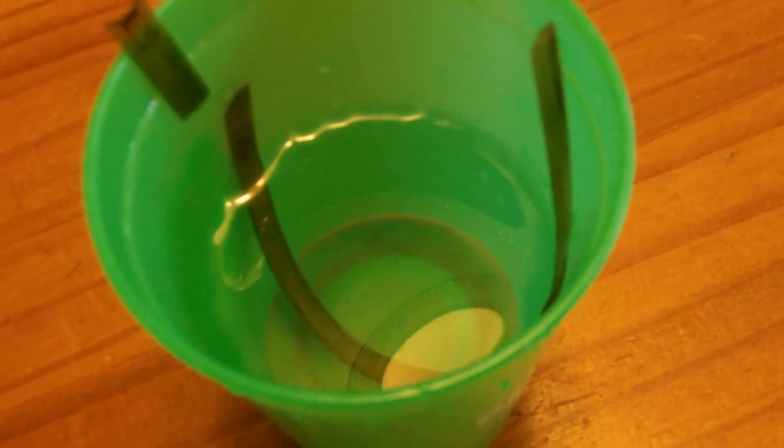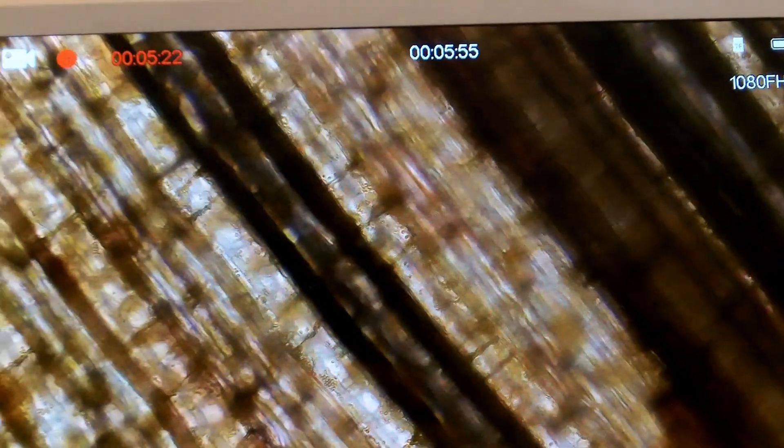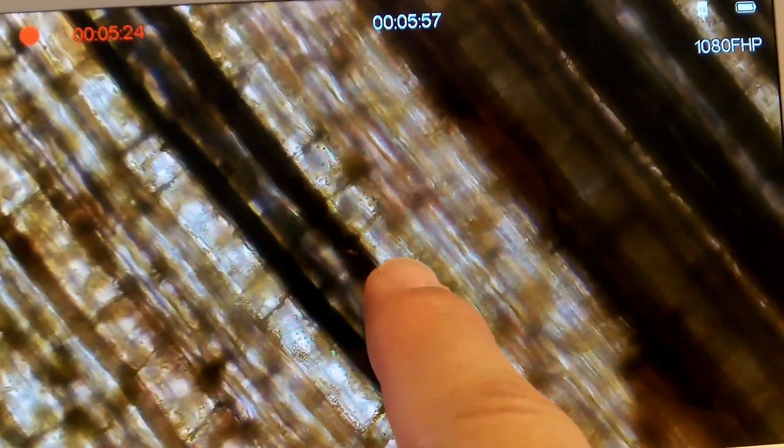We got a piece of grass and water from the lake. I have down there a super tiny piece of grass between two of the glass slides. And here, this is not the maximum magnification but the mid-level magnification level. There's actually little bubbles or organisms moving back and forth. I'm not sure if that's bubbles and capillary action moving up and down the grass or if those are microorganisms moving around it. Looks like they're all going in a line, so I kind of think it has to do with the capillaries within the plant.